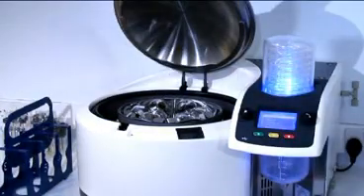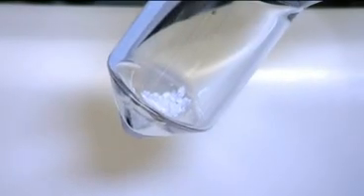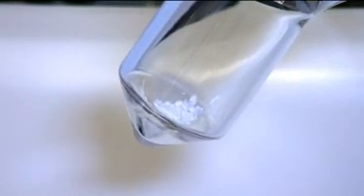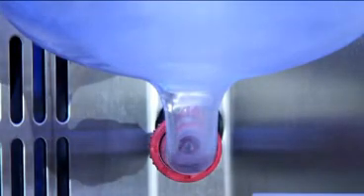When the system stops, open the lid and remove your samples. The Rocket takes 33 minutes to evaporate six flasks, each containing 250 millilitres of hexane. The system has an automatic draining cold trap, so it's ready for the next user.